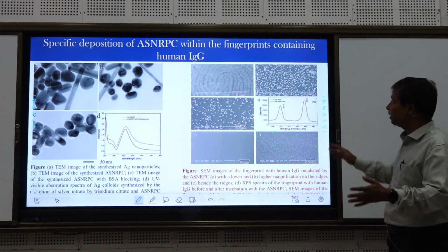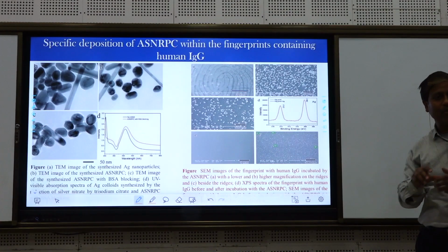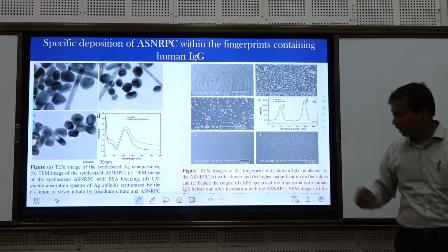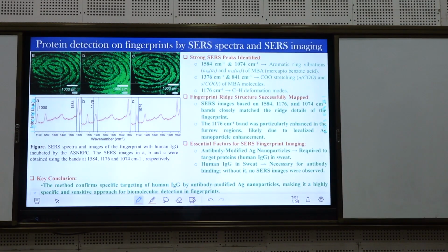What I wanted to tell you is that through this technique, they are trying to find out the information on protein, because this explosive will be in touch with the protein. So unless you deduct the protein contribution, you cannot find out the true explosive's Raman spectrum. So that is the same one.